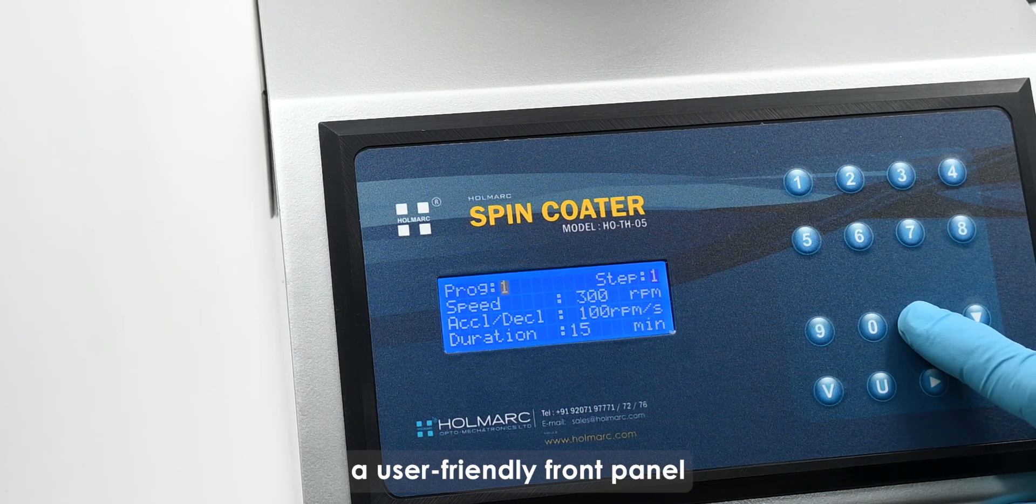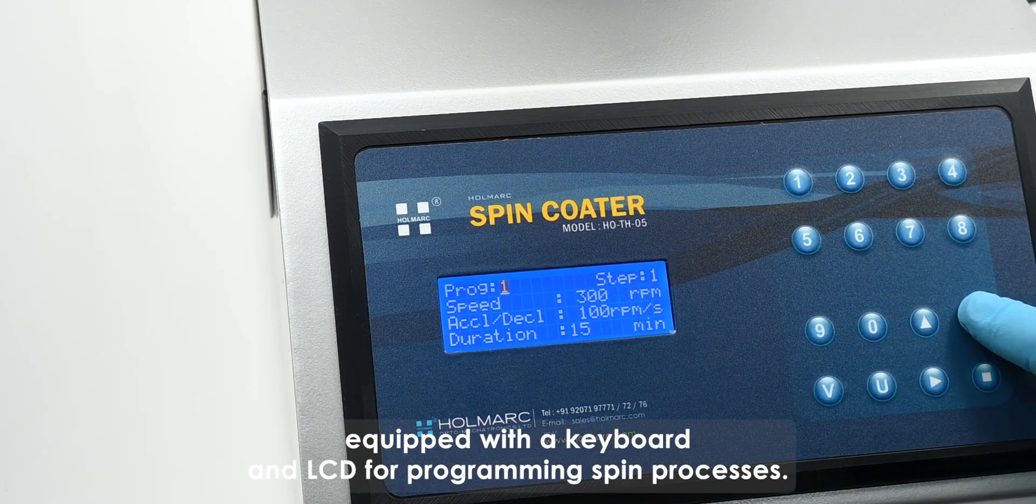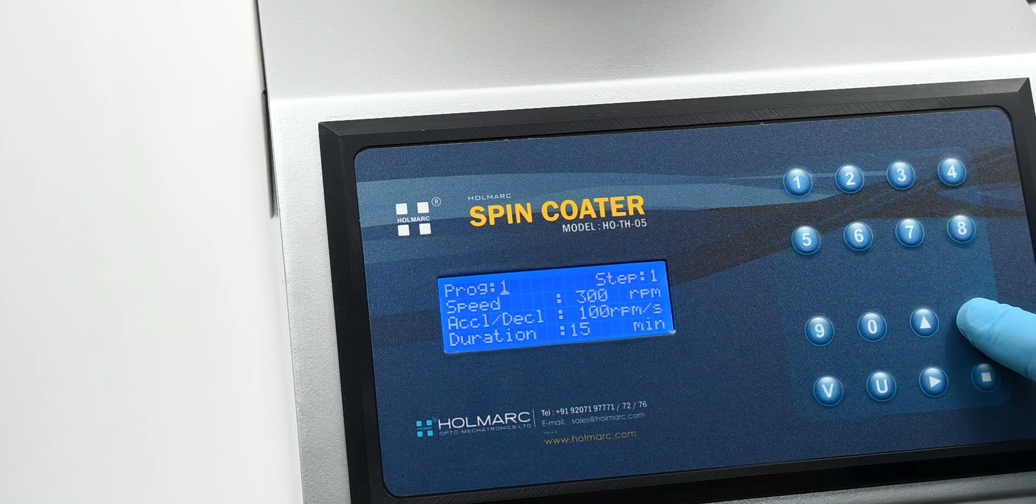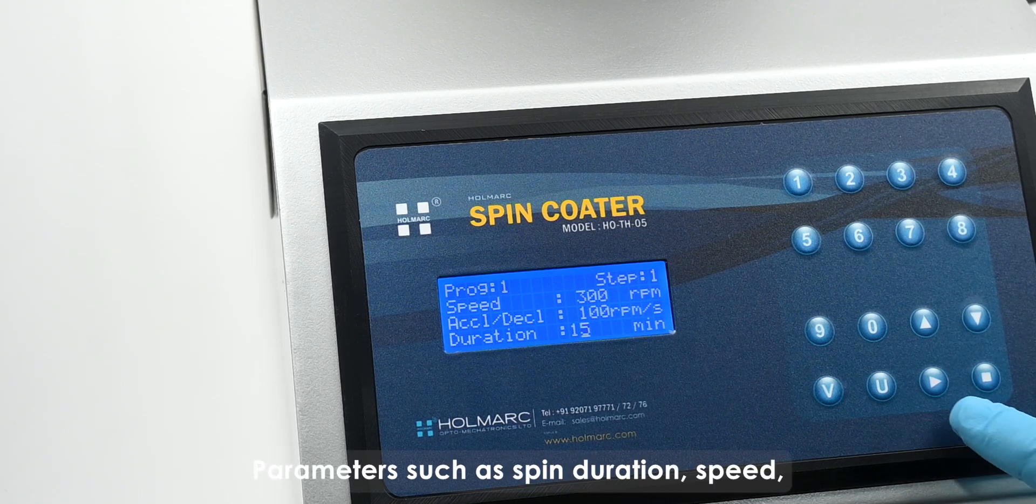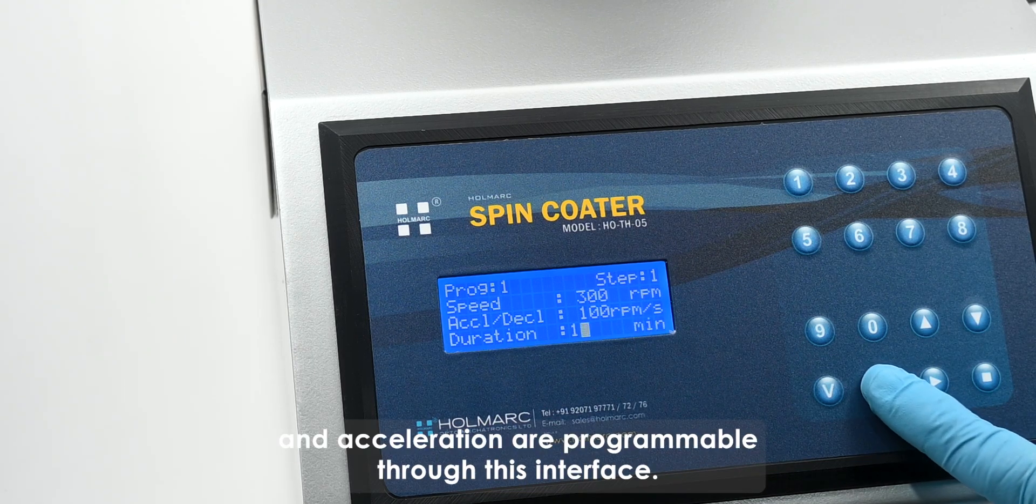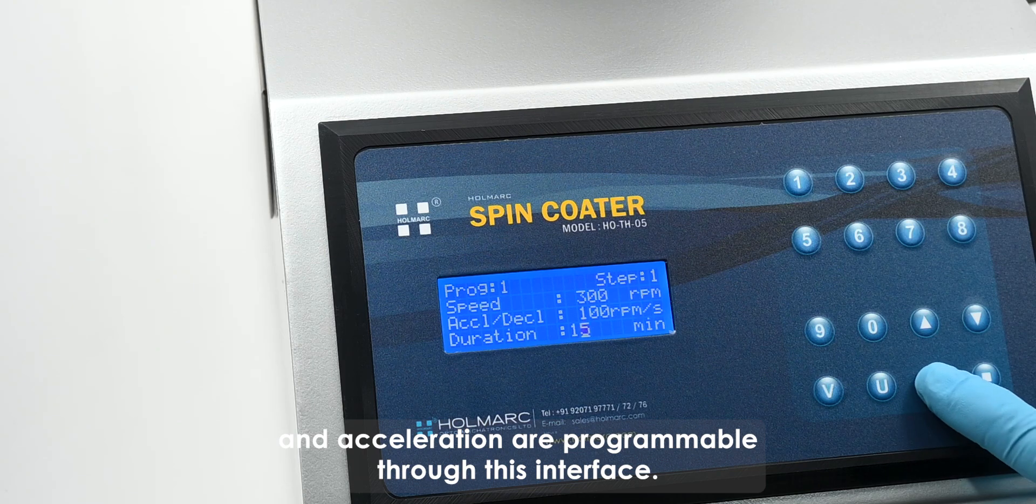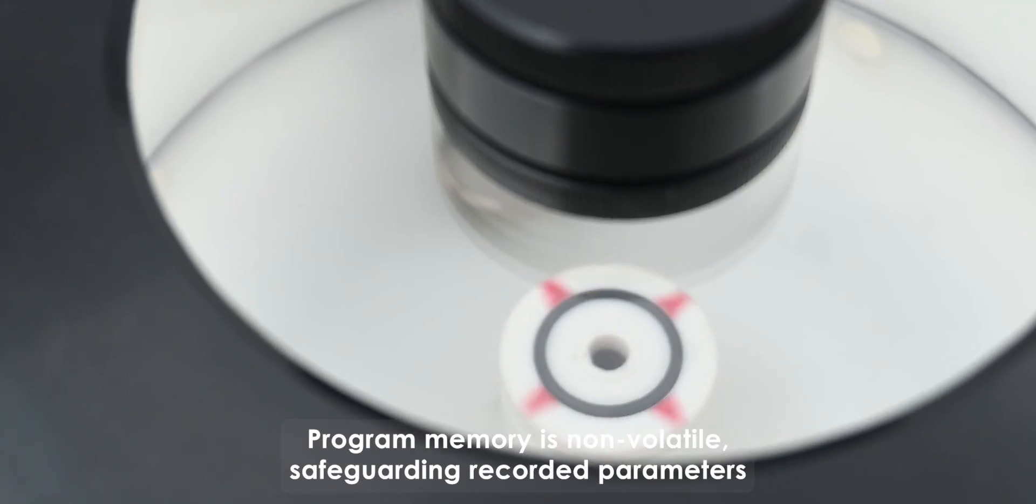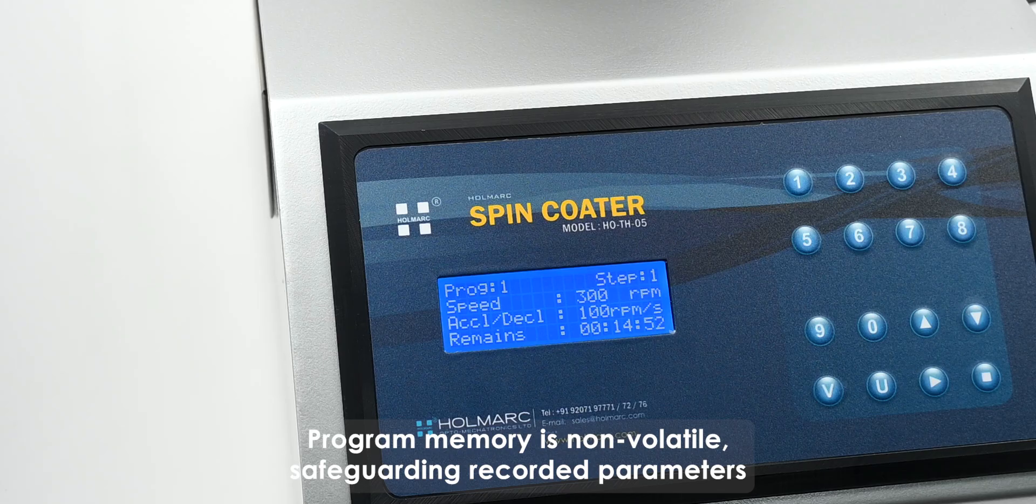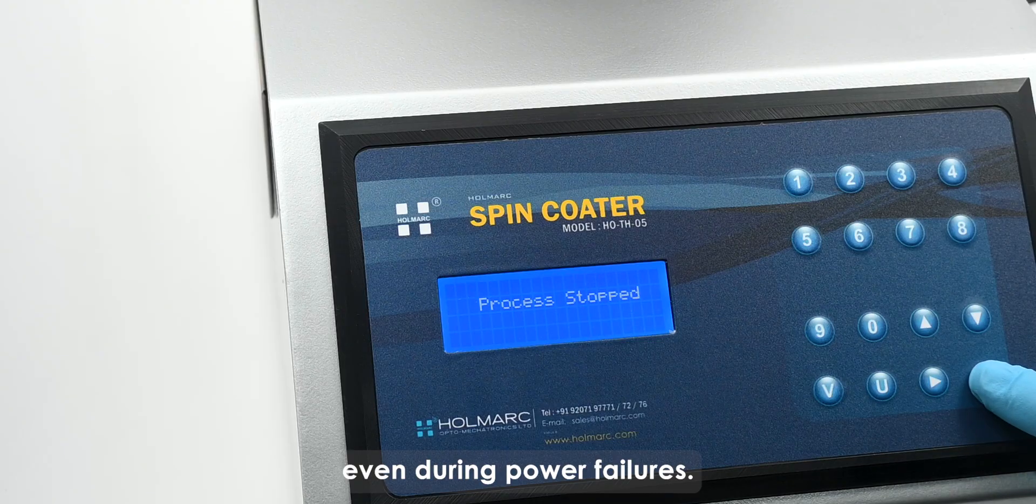The device features a user-friendly front panel equipped with a keyboard and LCD for programming spin processes. Parameters such as spin duration, speed, and acceleration are programmable through this interface. Program memory is non-volatile, safeguarding recorded parameters even during power failures.